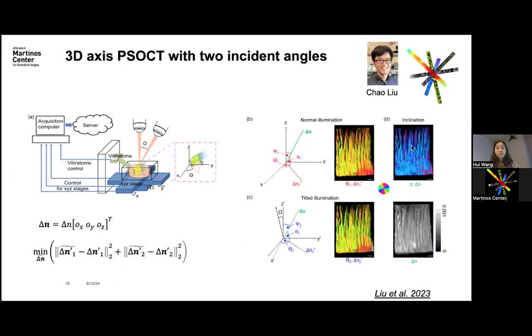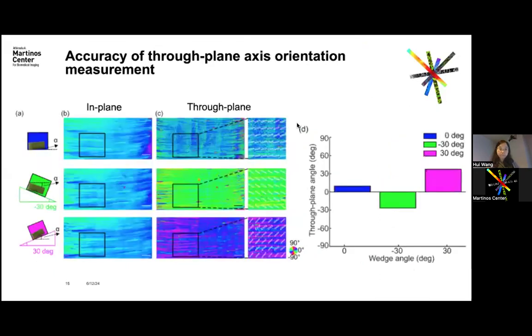And we can recover alpha, the inclination angle of the fibers. In parallel, we also estimated what we call the true birefringence, which removes the dependence of the birefringence on this alpha factor and reveals the real myelin content.